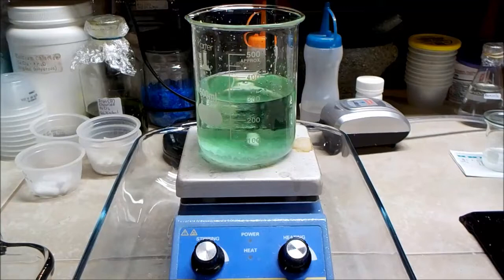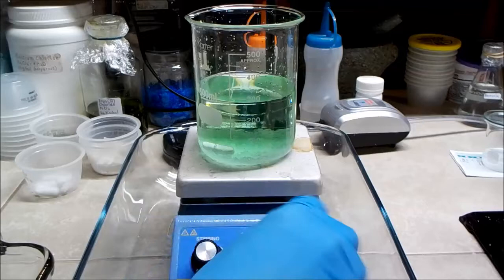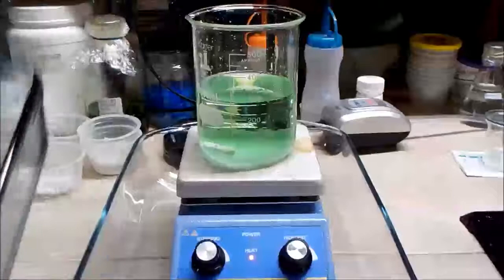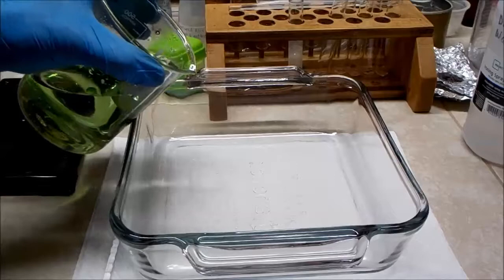I think the filtration, even though it took quite a while, was worth it because now it looks very clear. Anyway, I'll get that dissolved back into solution. And then I'm going to pour it out into this glass dish and let it set for quite a while. Hopefully I'll get some nice crystals. Everything's all dissolved now. So into the flat dish it goes.